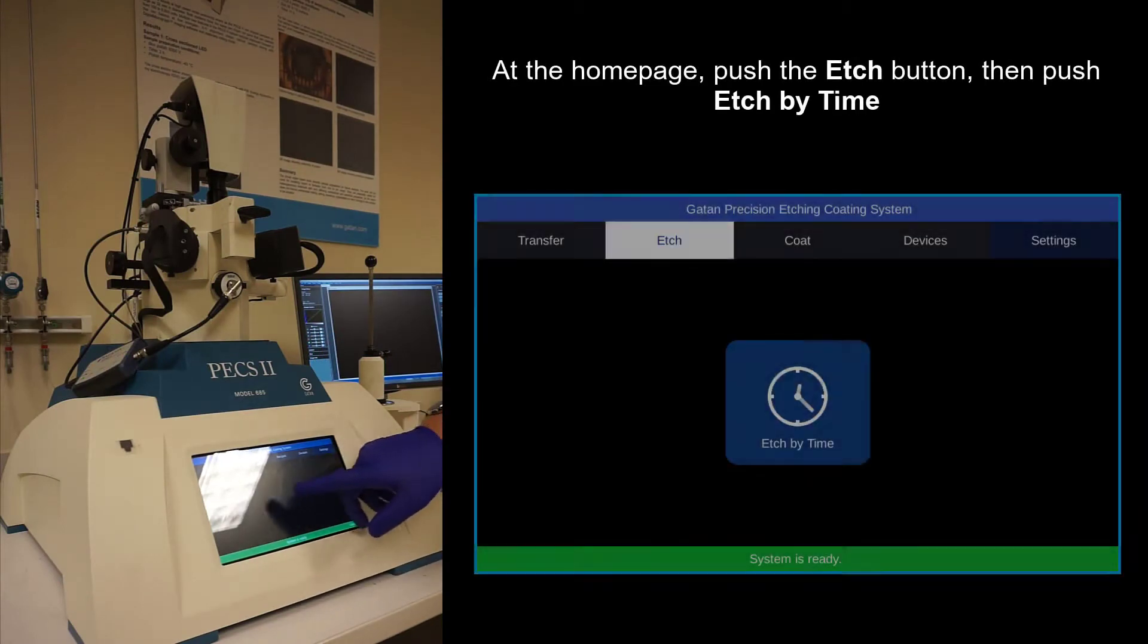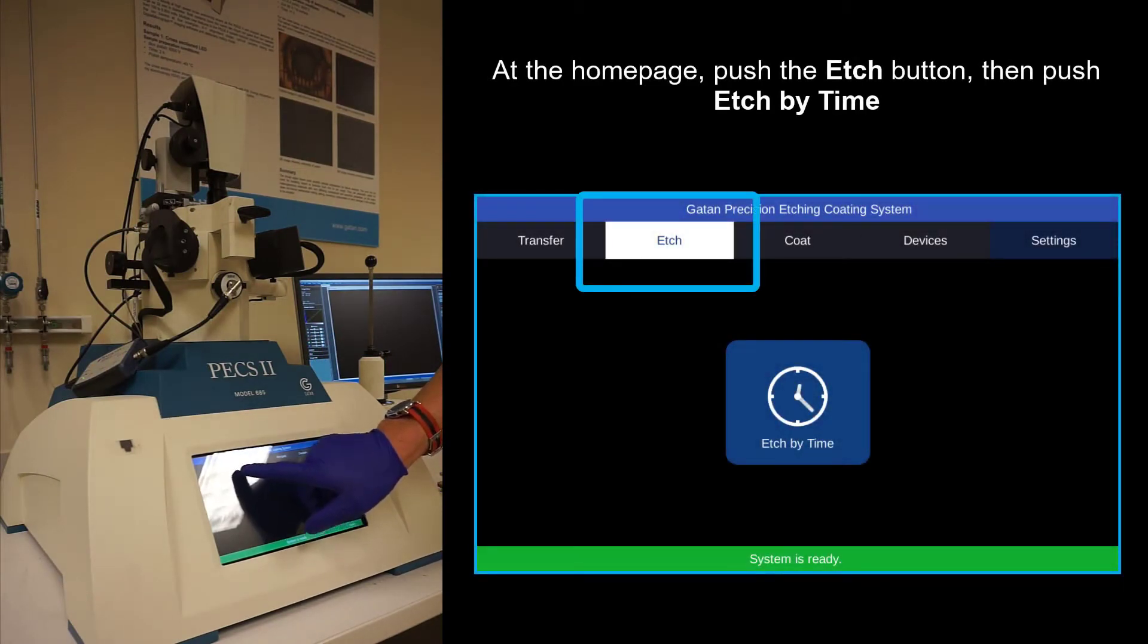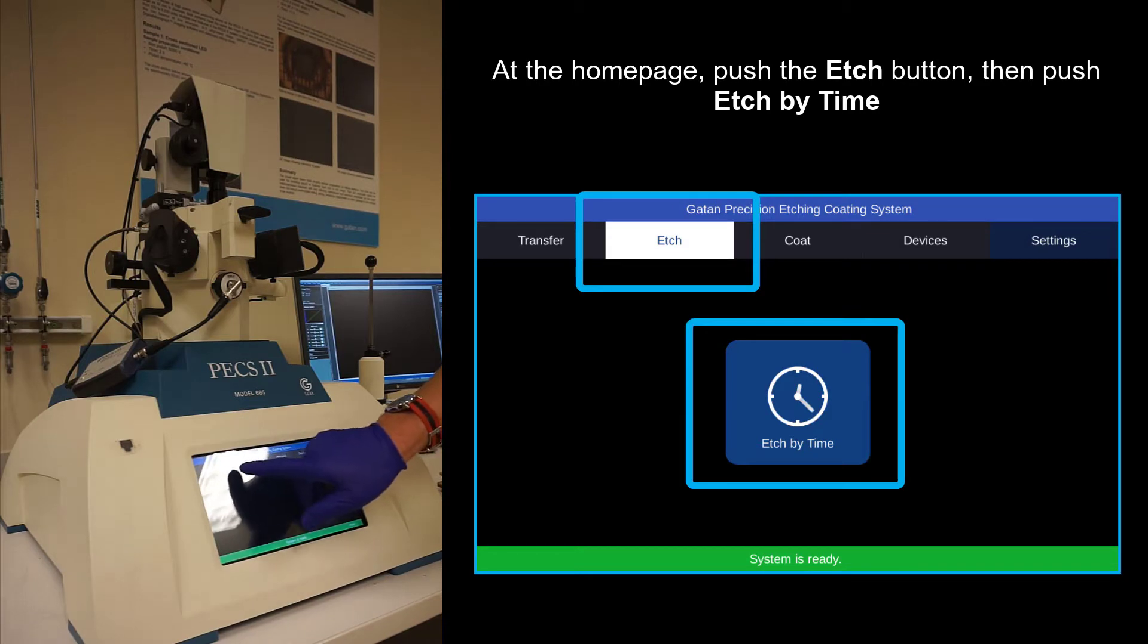Now when you want to align the sample, we're back on the home page here. Align at the etch position and say etch by time.